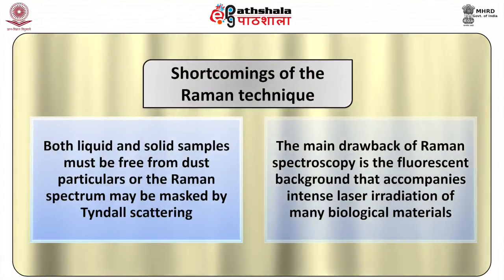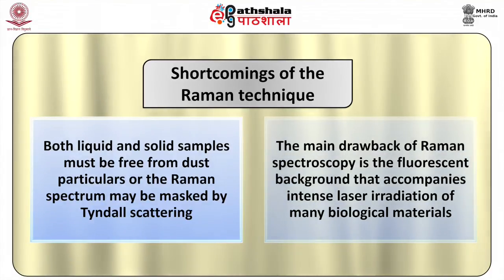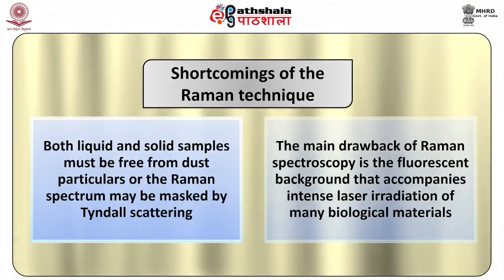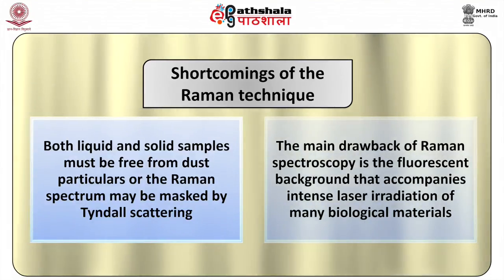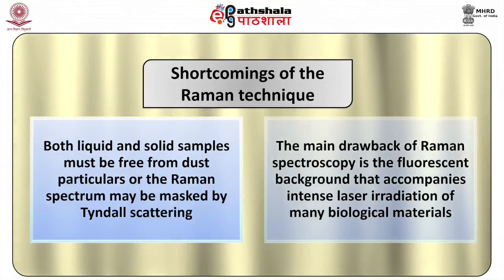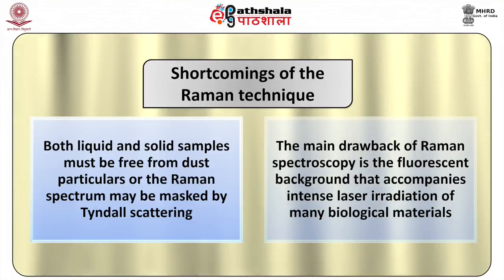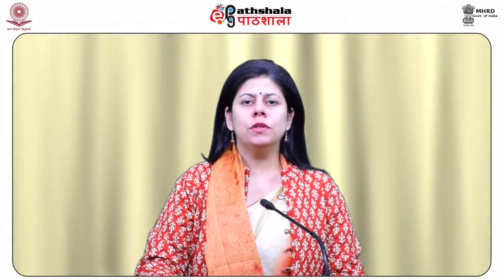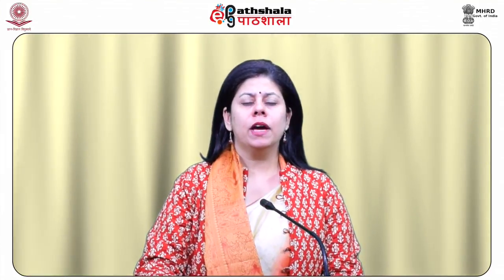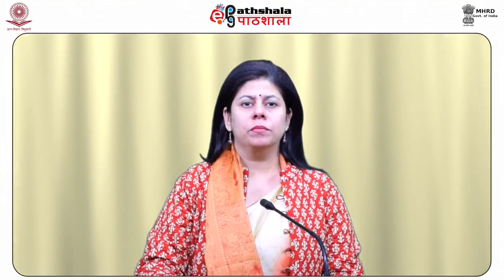There are some shortcomings of Raman technique. Both liquid and solid samples must be free from dust particles, or the Raman spectrum may be masked by the Tyndall scattering. The main drawback of Raman spectroscopy is the fluorescent background that accompanies intense laser irradiation of many biological materials. Proportional to the Raman signal, the background can be massive, entirely obliterating the spectrum.